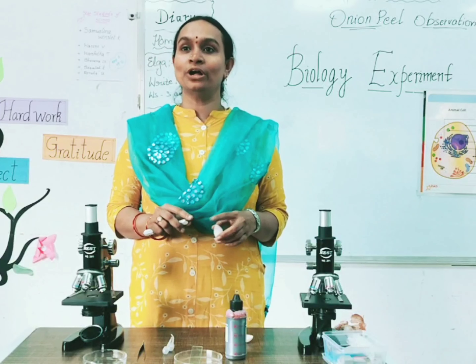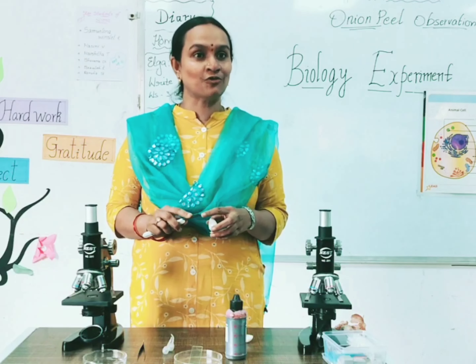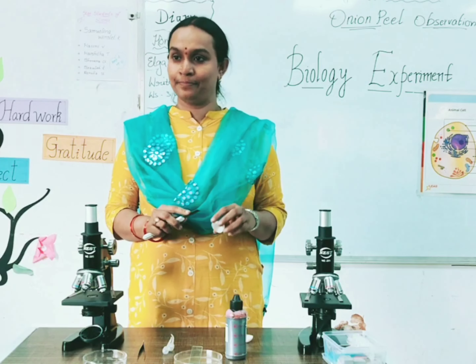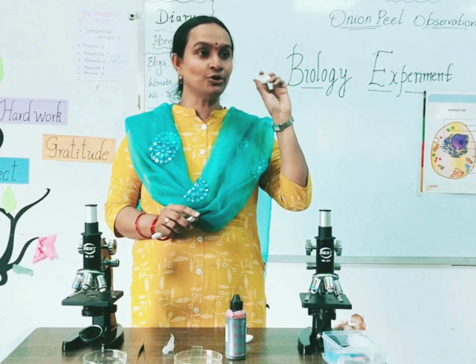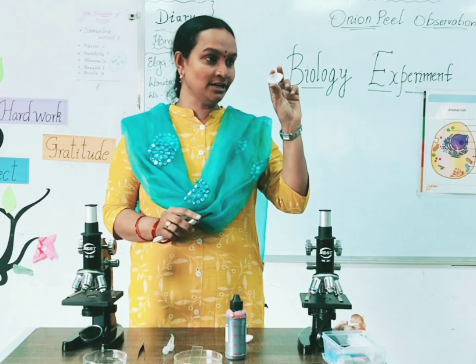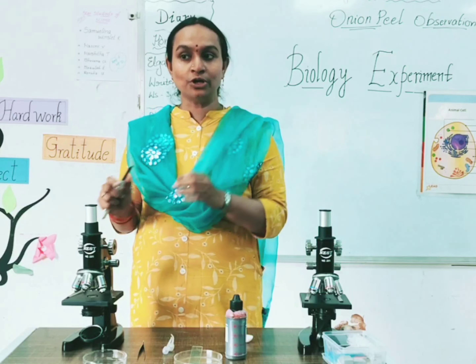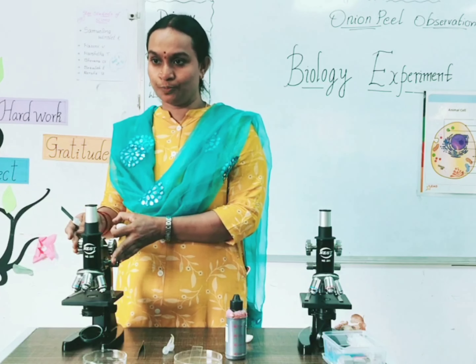Today we are going to observe the cells of an onion peel. I am going to take a peel of an onion and we are going to observe how the cells are there in this microscope.